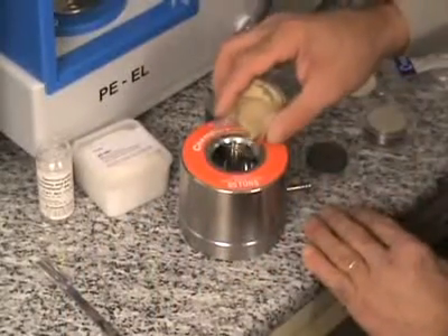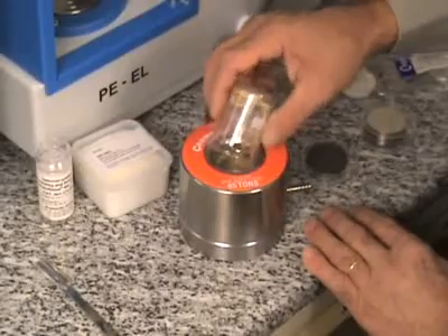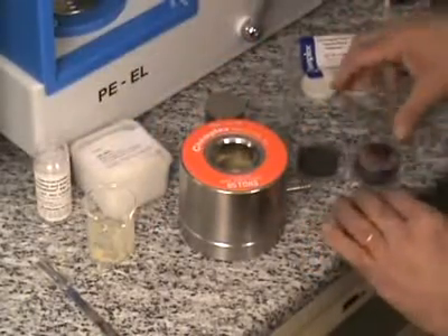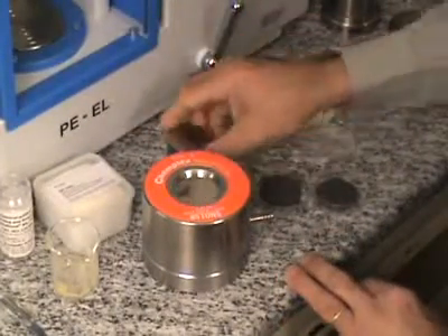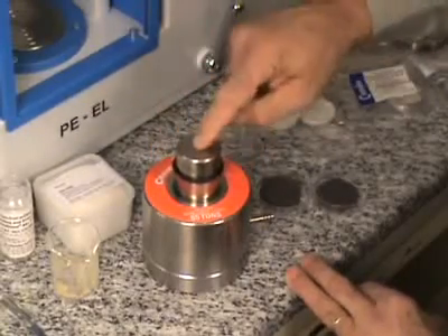The sample material is put on top and a second polished plate is put on top with the polished side facing downwards. Now the piston is inserted into the die set.